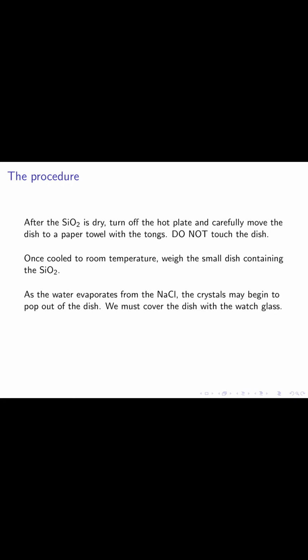As the water evaporates from the sodium chloride, the crystals may begin to pop out of the dish. You will likely hear this popping sound when it begins to happen. We must cover the dish with the watch glass to prevent the crystals from exiting the dish. However, if we cover the dish too soon, it will prevent the water from evaporating, so we must choose the proper time.